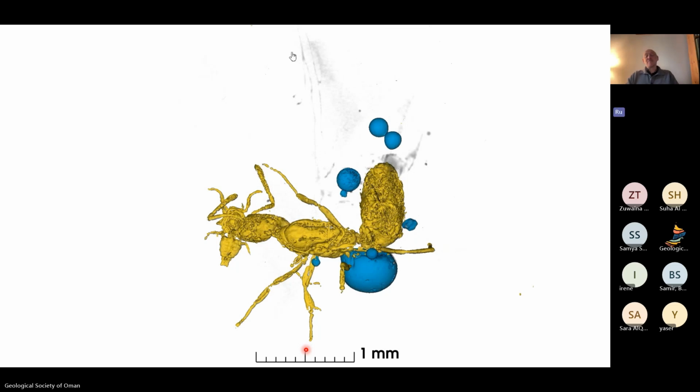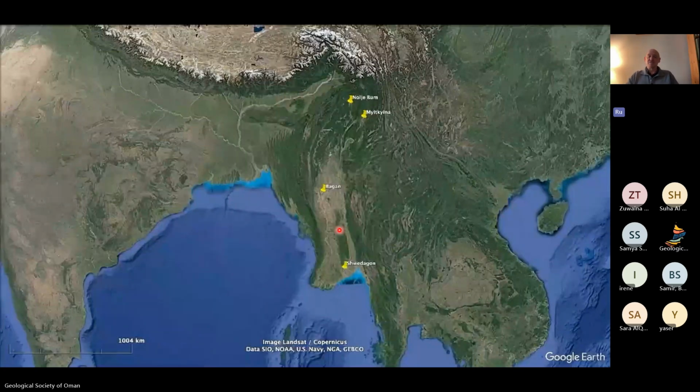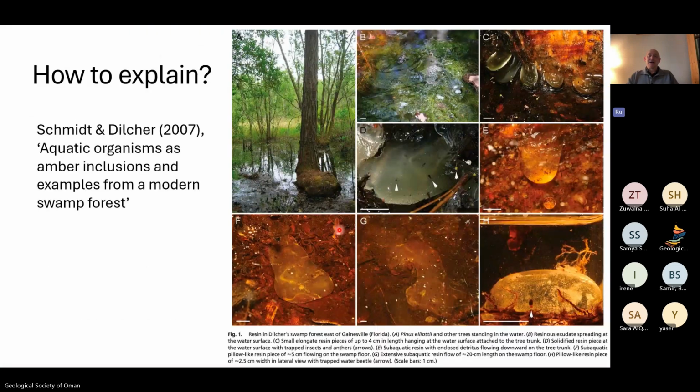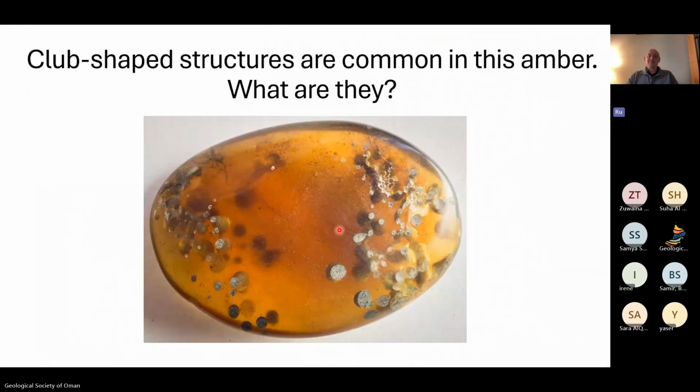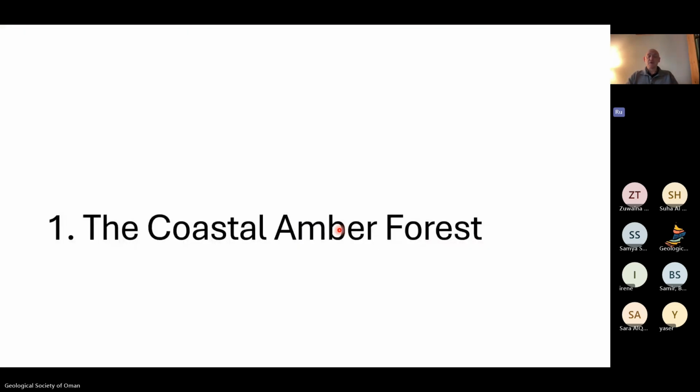So it's quite funny because you've seen I've had a third of a century subsurface career with lots of 3D modeling, lots of seismic interpretation, and it's similar, but at a massively tinier scale. So now we're on a microns to millimeter scale, but the problems are quite similar. Extract the information from the 3D data set using the best techniques you can, and then interpret it to understand what was going on.